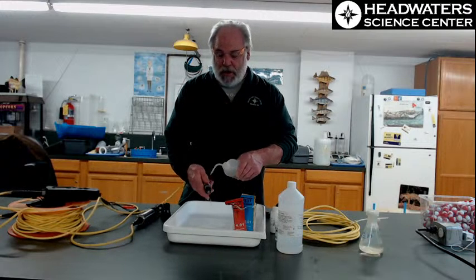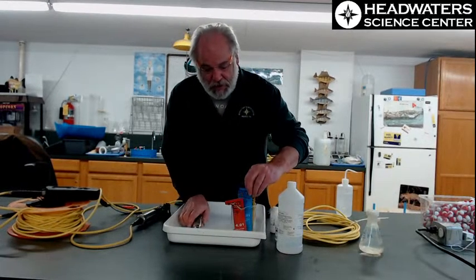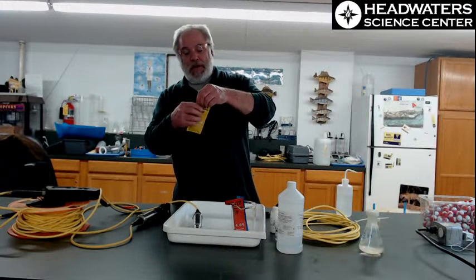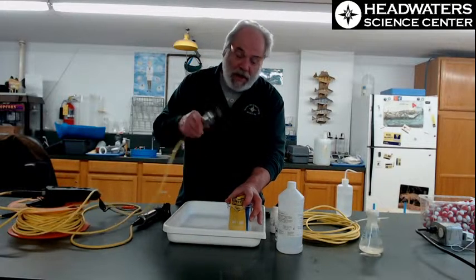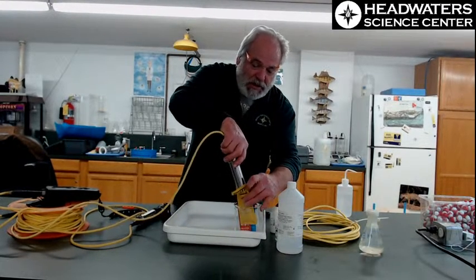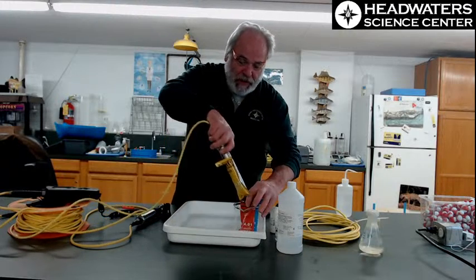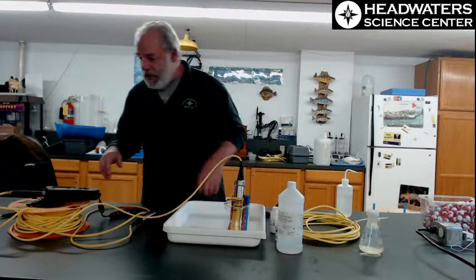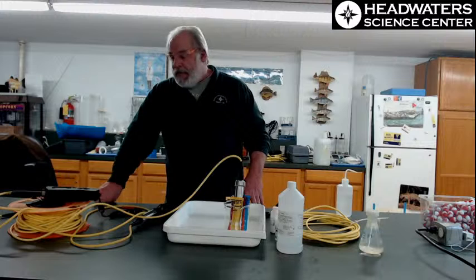So let's get that well cleaned, and I like to get right in there. This is a glass probe, and so it's a little sensitive to breakage. I want to climb up in order, so I do a 7 calibration as well. I'll put that one in front so you can see that, and I'll shake it up. Now that doesn't have very much buffer in it, so it's going to take this new pH and bring it right to where it is. These 7.0s are tight in the canister. These are field pH standards, so they're built to make it easy, and hopefully that helps you out here. Again, we're going to read it, and it should come in around 7.